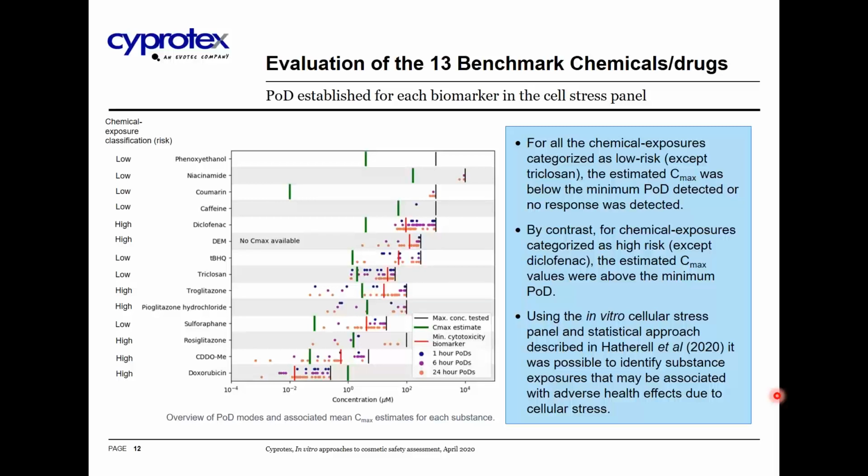Interestingly, in the 3D data that I showed you, even though you couldn't quite see the detail, diclofenac is picked up in a 3D long-term repeat dosing model. And as I said, this publication is pretty much close to being in press.